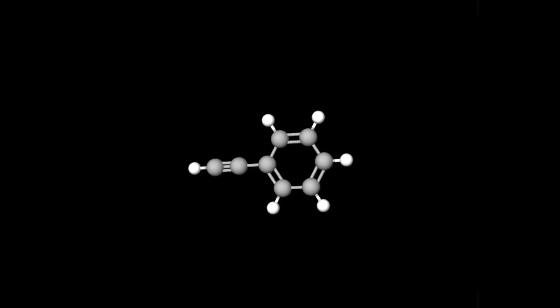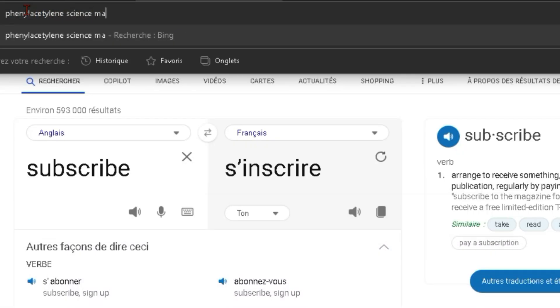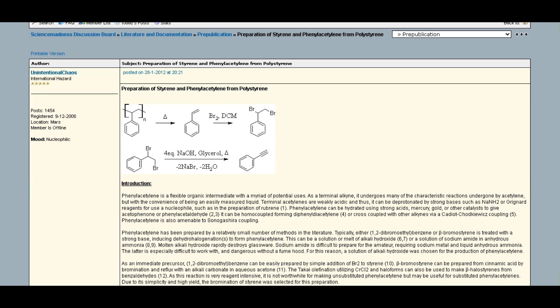This is phenylacetylene. It's a goofy molecule that has similar properties to the gas acetylene, but is a liquid, so it's much more practical to work with in the lab. I'm pretty bad at organic chemistry, so I wanted to make it to train myself.